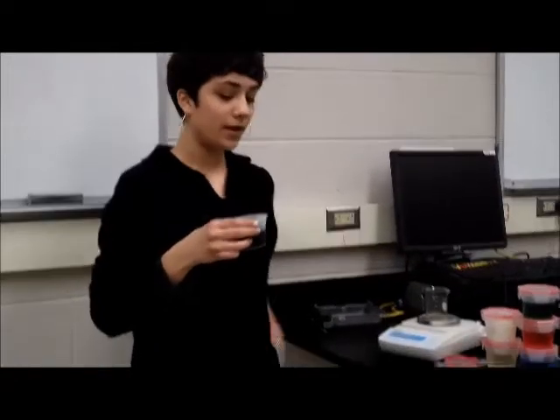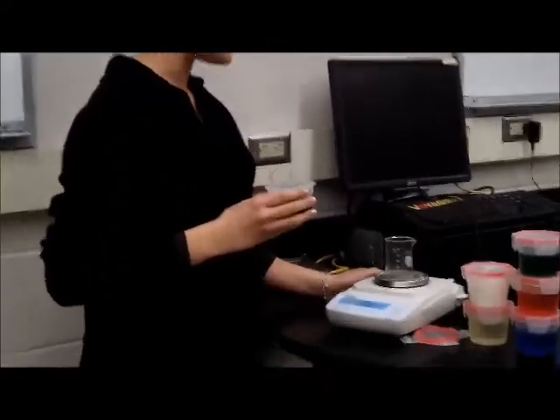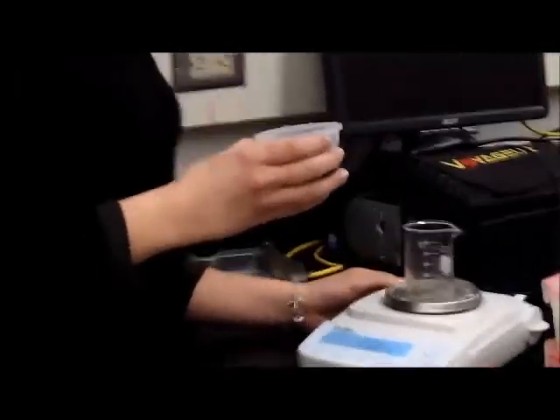Hey everybody, today we're going to be performing density calculations with 6 different liquids. We know that the formula for density is mass divided by volume, so we will be determining the separate factors in this experiment. Here we have 100 milliliters of syrup, and we'll be finding the mass of this liquid on this balance.